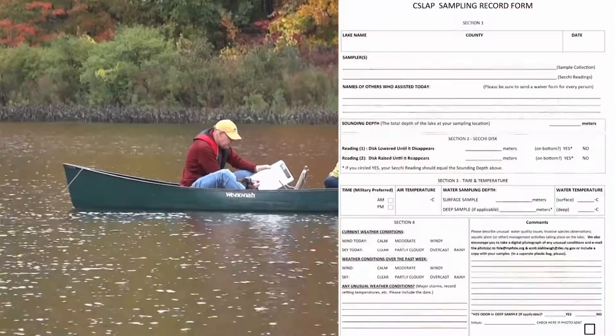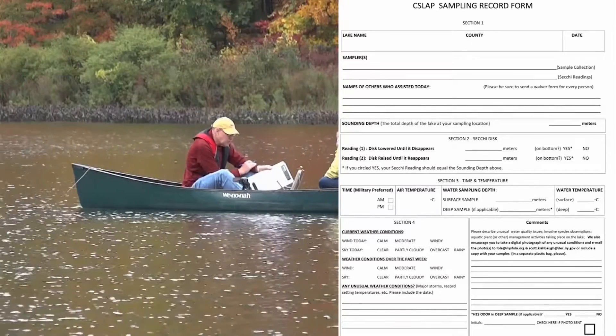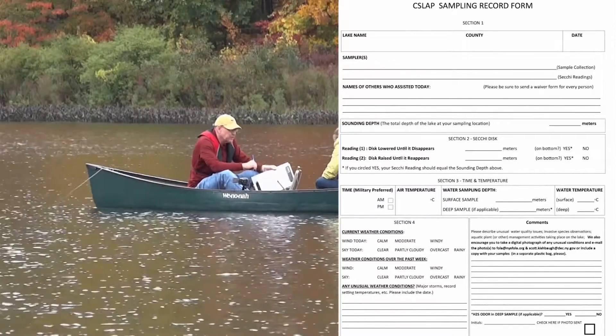Section 3 is the section dedicated to the water sample collection. To collect a water sample, you're going to use a device called a Kemmerer bottle, which is also here in the crate.